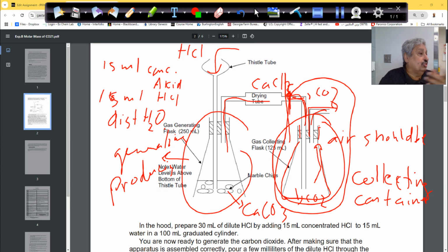You cannot weigh it on the small balance. You have to use the flat balance. This will be very heavy. When you fill this Erlenmeyer flask all the way, with the two tubings, with distilled H2O, and weigh it, that will be a larger amount. And then you get the weighing. The weighing should be really consistent.